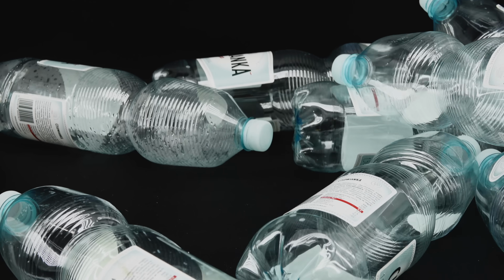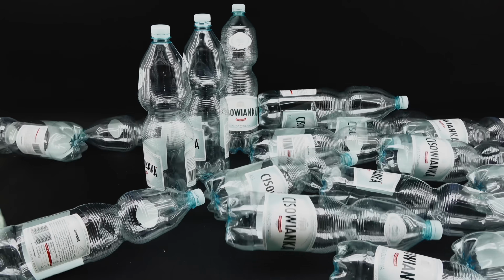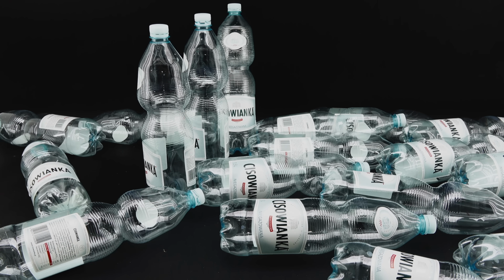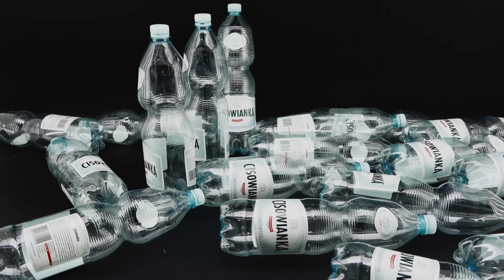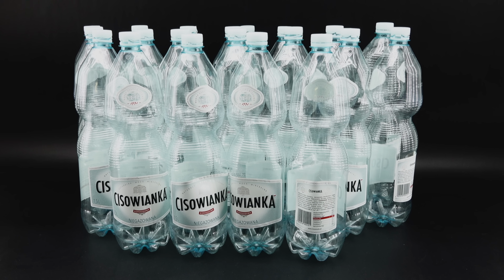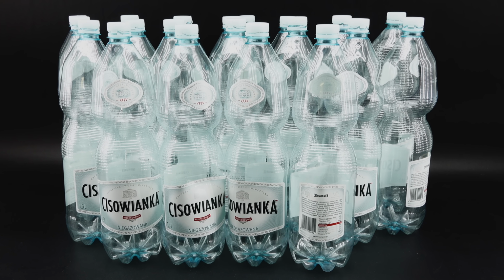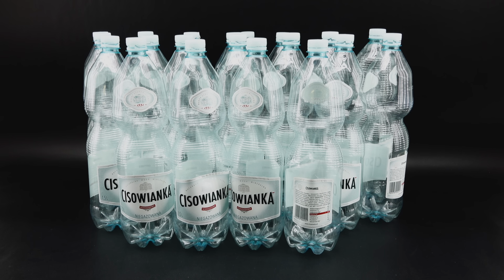This was quite easy, since after only like 2 weeks of saving every bottle I drank from, I collected 20 of them. They make for some good bowling pins and should contain around 400 grams of plastic, which is the scale I want to work on. I figured that even if my yield is trash, this much plastic should be enough to get a good amount of benzene, and before doing any chemistry, I had to prepare it a little.